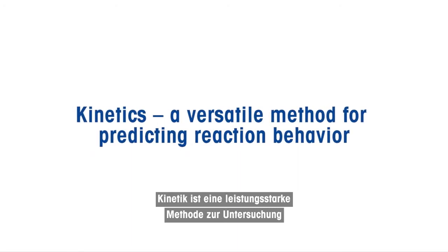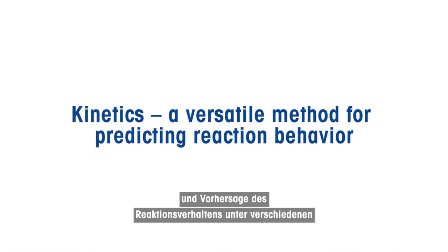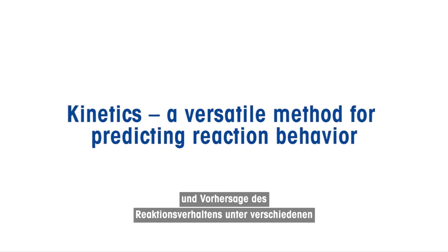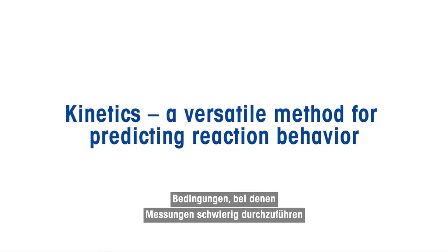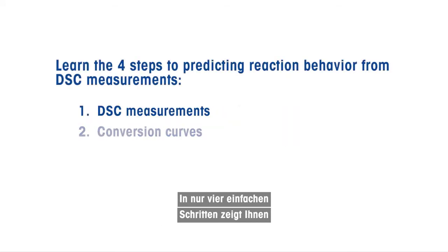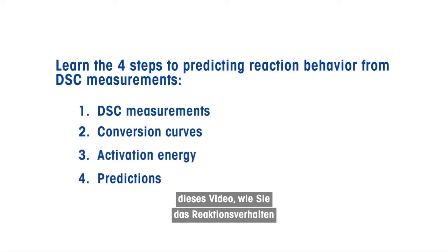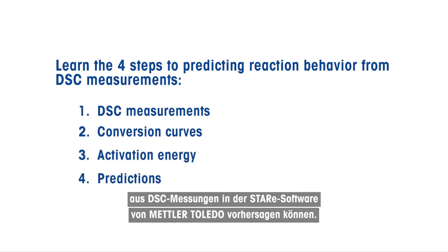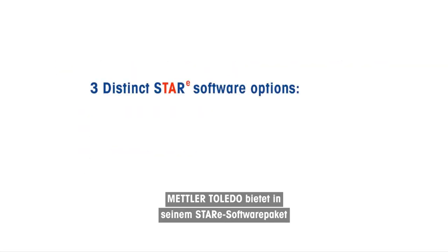Kinetics is a powerful method for investigating and predicting reaction behavior under different conditions where measurements are difficult to perform or where the reaction times are very short or very long. In just four simple steps, this video will show you how to predict reaction behavior from DSC measurements in Mettler Toledo's STAR-E software.